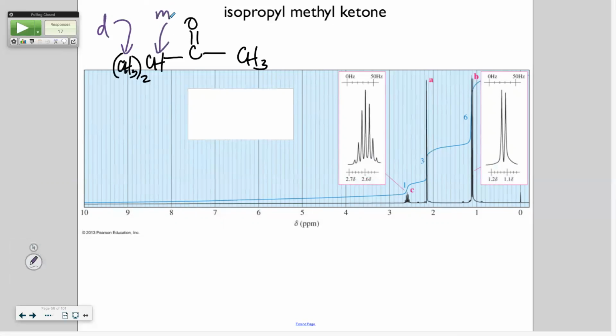What about that CH3 on the right? Does it have any neighbors? No, so what should we see? A singlet. Okay, can you see them all? And if you look down here, this little one that's split with all those hydrogens, they blew it up.